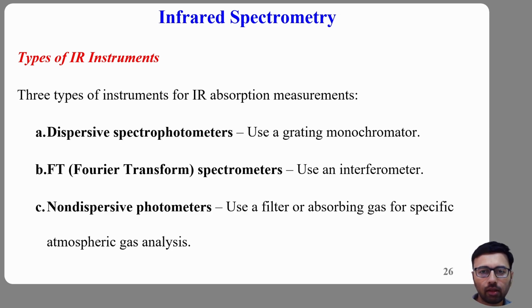Today we ask a very practical question. How do we actually measure infrared absorption experimentally? How does an IR spectrometer detect molecular vibrations and convert them into spectra we analyze in the laboratory? That is exactly what we explore today.